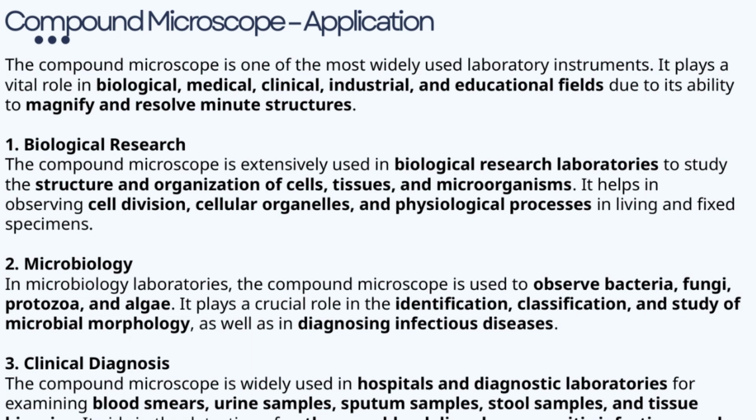Moving into clinical diagnosis, the microscope plays a vital role in hospitals and diagnostic labs. It's used to examine blood smears, urine, sputum, stool, and tissue biopsies. By doing so, it helps us detect pathogens, blood disorders, parasitic infections, and abnormal cells. So overall, the compound microscope is not just a tool. It's a cornerstone in advancing our understanding and diagnosis across many scientific and medical fields.